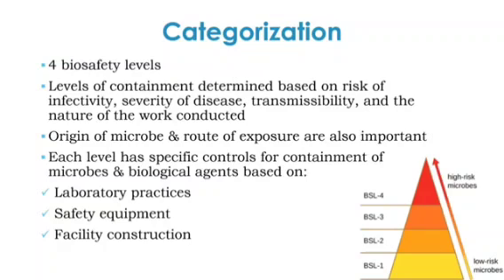The levels of containment are determined based on the risk of infectivity, severity of disease, transmissibility, and the nature of the work conducted. The origin of microbe and route of exposure are also important. Each level has specific controls for containment of the microbes and biological agents based on laboratory practices, safety equipment, and facility construction.